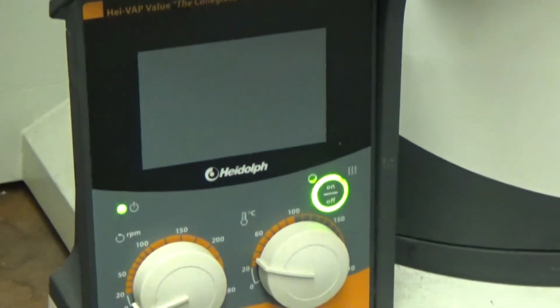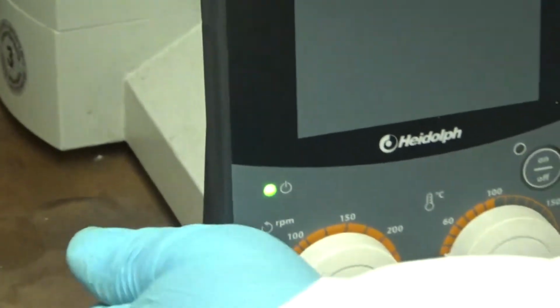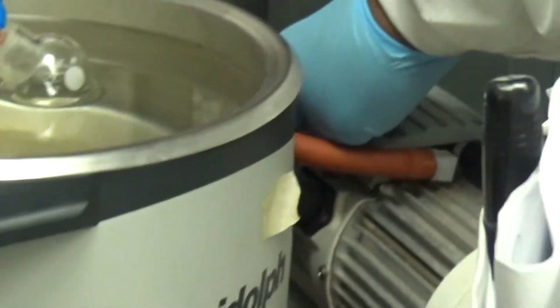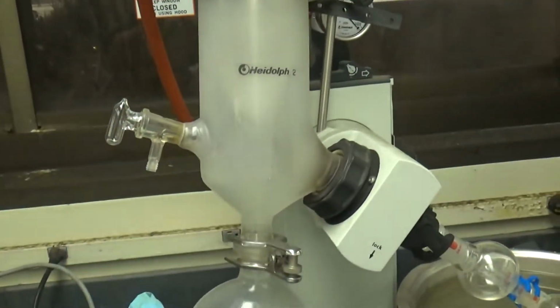Stop the rotation. Okay, so it's done. You stop the rotation. Turn off the water bath, so you don't forget to turn off here. Turn off the switch. Turn off the pump, and you release the pressure. There's a vacuum.